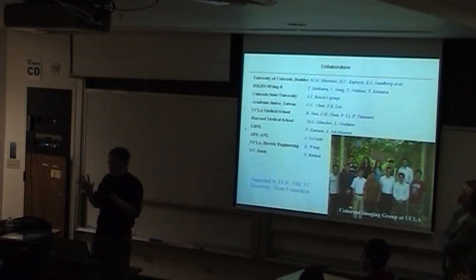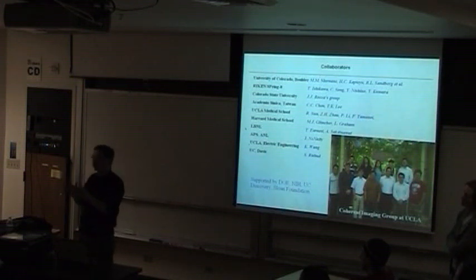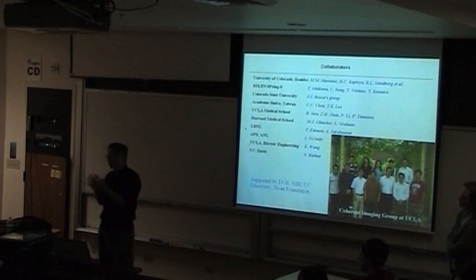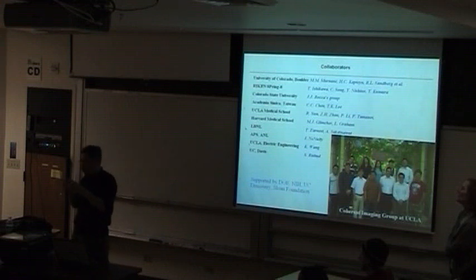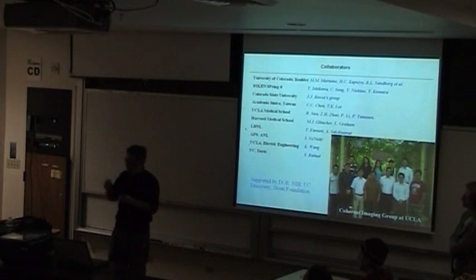But the field has developed to a point that as long as you get a good diffraction pattern, the reconstruction is always very straightforward. I always emphasize that when we do an experiment, we want a high quality pattern, which means getting the signal-to-noise ratio as high as possible and reducing background. Then the reconstruction is very straightforward.